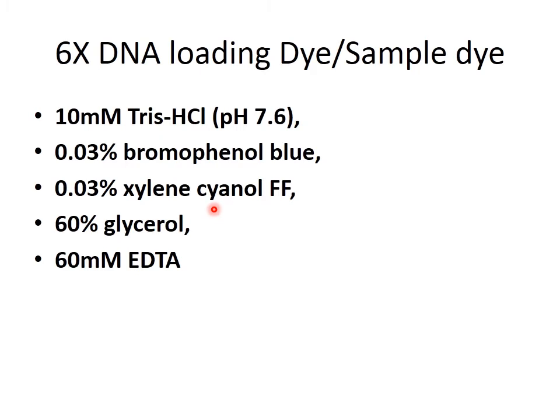So to make it visible, these color dyes are added to the loading dye, and one important function of adding the color dyes is to make the DNA solution visible while it is being loaded onto the gel. Another important implication is that bromophenol blue migrates at a rate similar to the migration of about 300 base pair DNA.